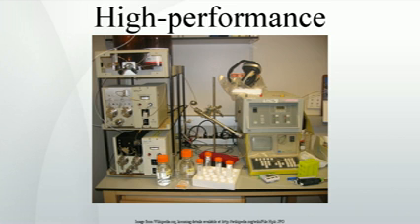The interaction strength depends not only on the functional groups present in the structure of the analyte molecule, but also on steric factors. The effect of steric hindrance on interaction strength allows this method to resolve, separate, structural isomers. The use of more polar solvents in the mobile phase will decrease the retention time of analytes, whereas more hydrophobic solvents tend to induce slower elution, increased retention times.